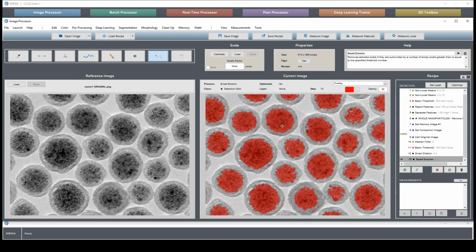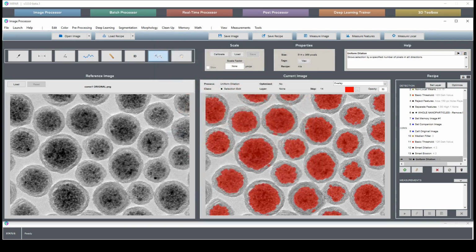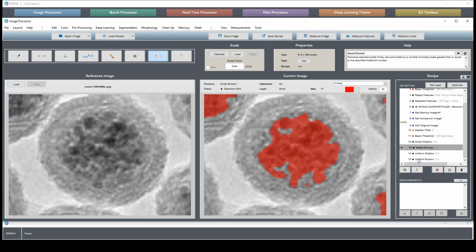Again, there's always going to be a trade-off between selecting false positives and selecting false negatives. So, say we do a dilation of 2, about like that maybe, and an erosion of 2. Yep, where does that leave us? That looks pretty good. That also cleaned up this sort of gnarly looking core here. Looks a little bit better.